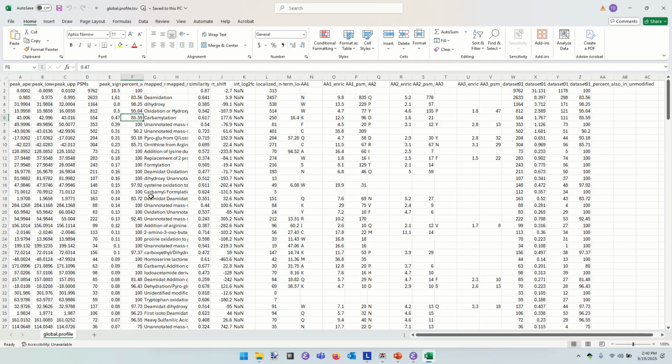What about carbamylation? What did we learn about carbamylation? Well, we knew that we had some old urea on hand, and in this case, suddenly column M has a value. These are N-terminal proclivities, basically. So if the modification is not happening on a particular chemistry of side chain, it may be happening on the terminus specifically, because they all have a peptide N-terminus irrespective of what side chain is there.